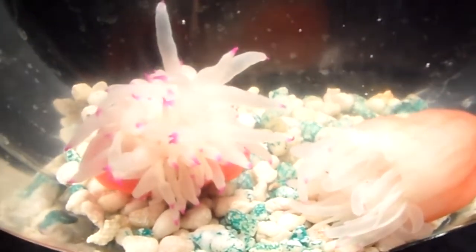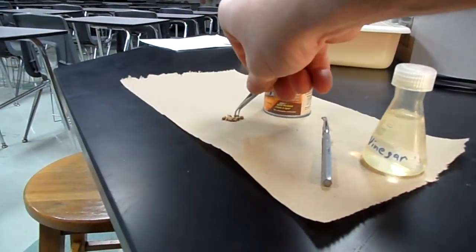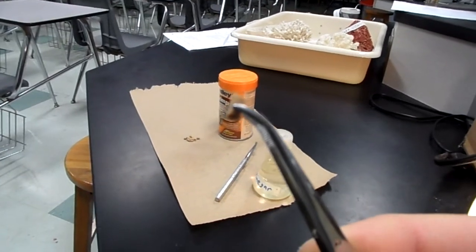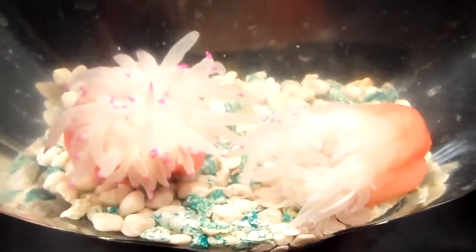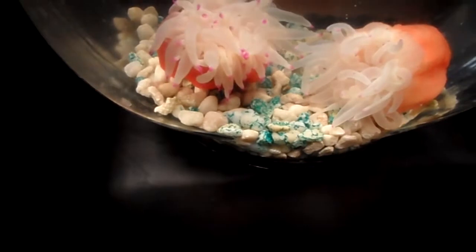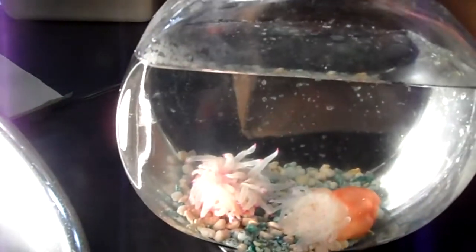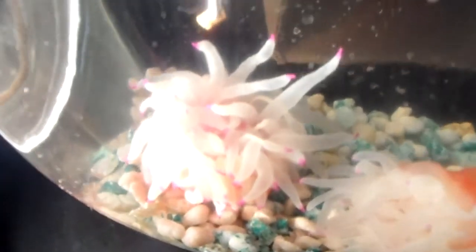Now hopefully I haven't harassed him to the point where he's not interested in the brine shrimp. And I'm going to use the forceps and just pick up one small piece of brine shrimp. Pellets. Shrimp pellets. Actually, it's not brine shrimp. It's regular shrimp just like at Red Lobster. I'm going to have to move the light again. Pick up the brine shrimp. And I'm going to simply place it into the tentacles. Oh, and I missed. So I'll get another piece.